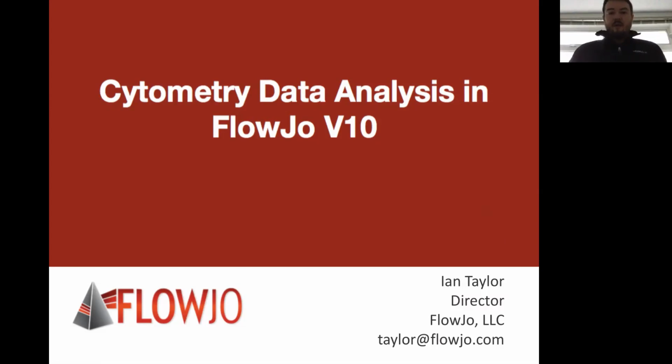All right, so without further ado, again, this is going to be kind of a general overview of all the major functions and features in FlowJo version 10. I'm not going to get into too many specifics here because this is an intro. And so for the beginners, people that haven't used FlowJo before, we want to give some kind of broad strokes and just get you familiar with the general pieces.